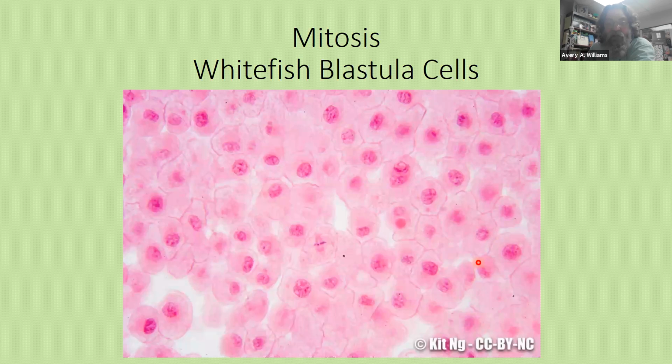So they're basically clones of one another. But there are different stages that take place in the development. You might go into more detail in lecture, but in lab, using light microscopy, you're limited in how much detail you can see. So basically we look at the basic stages of mitosis that take place.